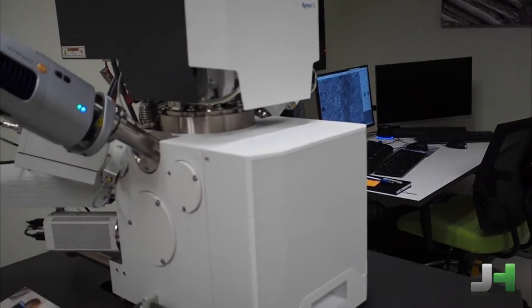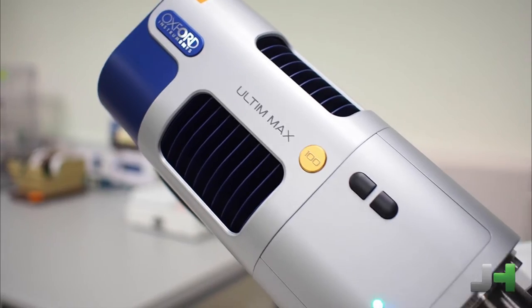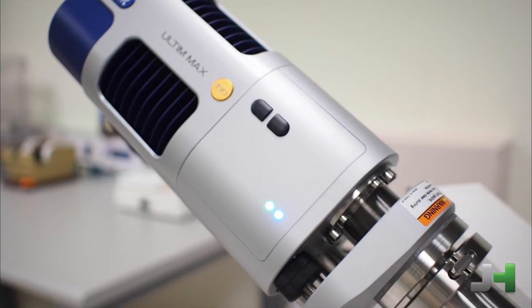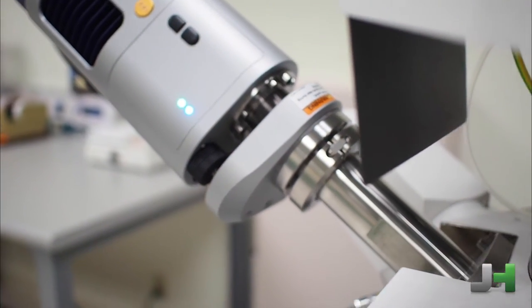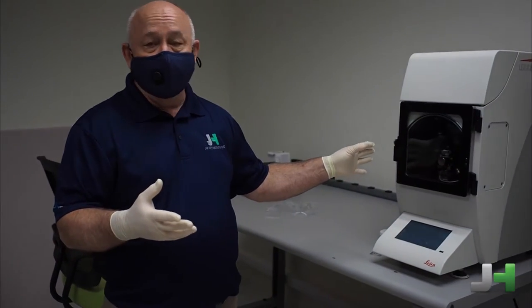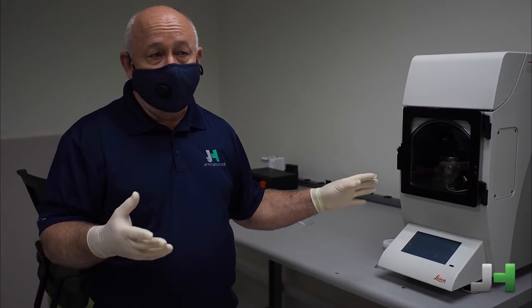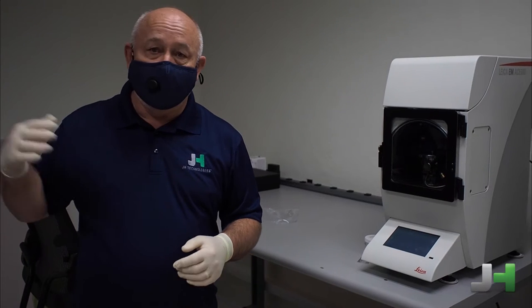We brought this tool in because many of our customers wanted to understand how the Leica sample prep products, and we have some examples of those products here as well. Customers wanted to understand how these tools made the images better on the SEM.